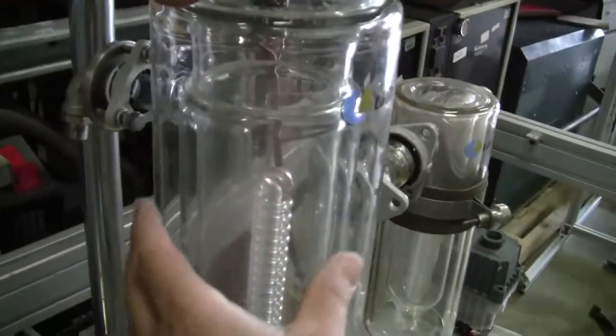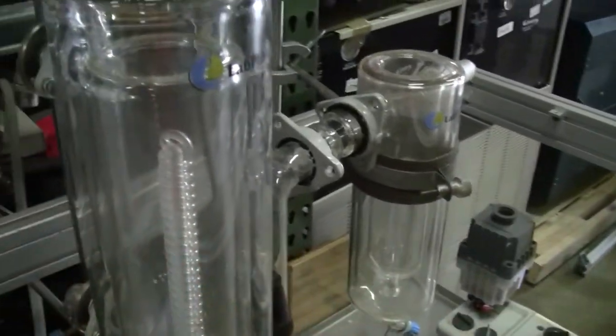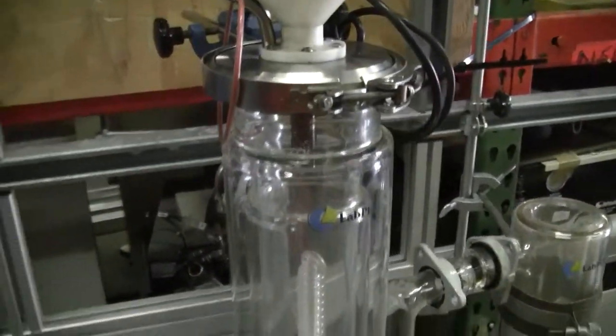This is an unusually large diameter unit. You can see the jacketing connections in the back. Check our website for more details.